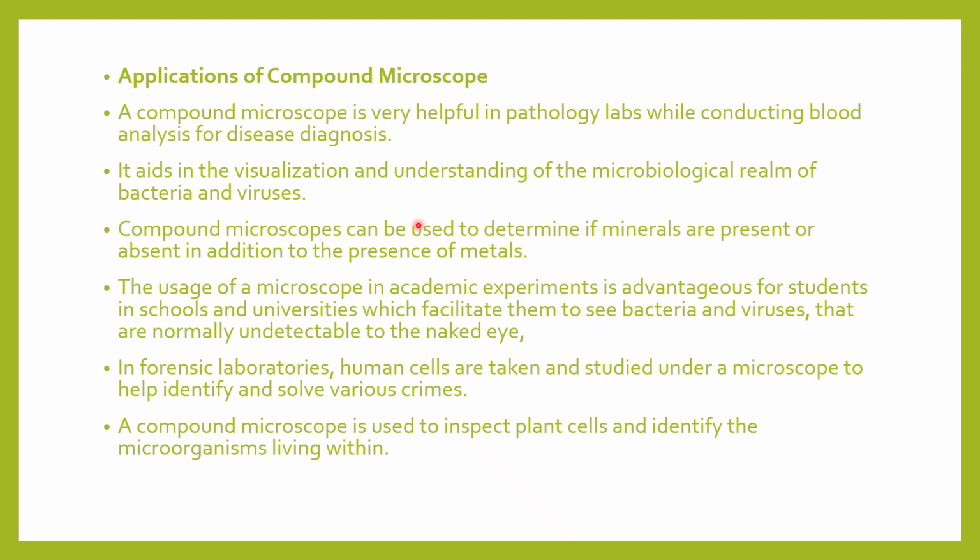Apart from that, it aids in the visualization and understanding of the microbiological realm of bacteria and viruses. You can study in detail about bacteria and viruses. It's also used to determine if minerals are present or absent, in addition to the presence of metals. And the usage of the microscope in academic experiments is advantageous for students in schools and universities, which lets them see bacteria and viruses that are normally undetectable to the naked eye.